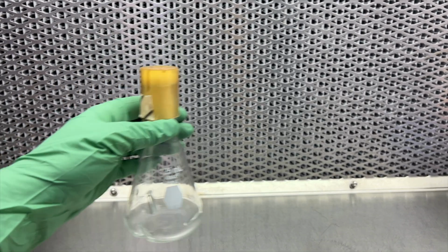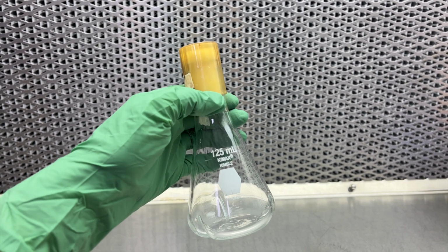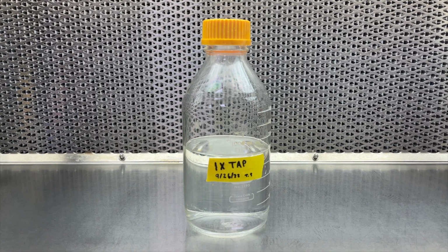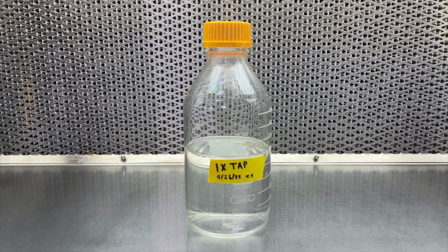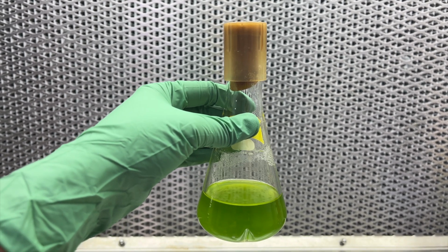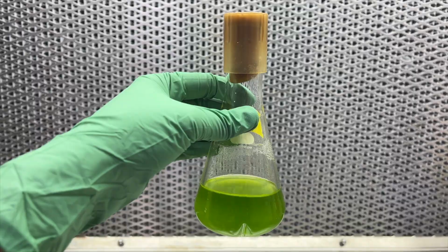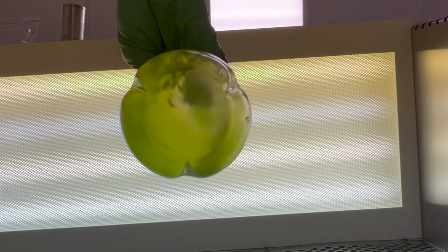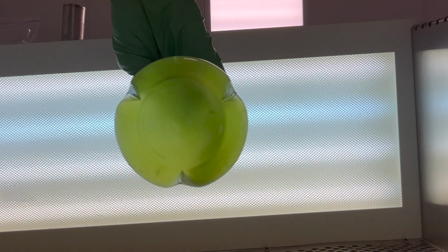First, grow C. reinhardtii cell cultures in a baffled Erlenmeyer flask. We used a 125 ml flask containing 60 ml of tap medium, for 4 to 6 days prior to transformation, or until the cell count reaches around 3 × 10⁶ cells per ml. In our project, we used the strain CC400, which is a cell wall deficient strain of Chlamydomonas reinhardtii, and we suggest that if possible within the scope of your project, you also use a cell wall deficient Chlamydomonas reinhardtii strain to avoid the difficulties associated with transforming strains containing cell walls.